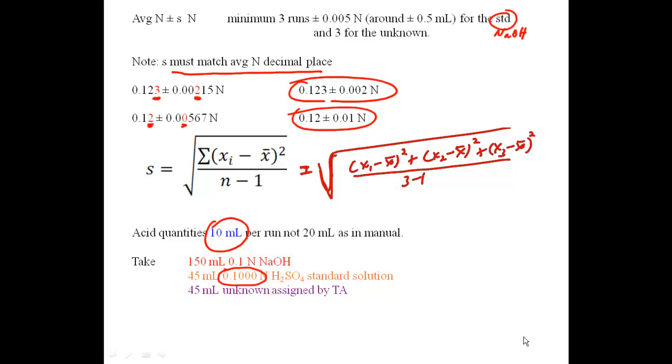As you're doing this experiment, make sure that you're writing the procedure in your notebook as you do it. You don't write the procedure later. You don't write the procedure when you go back to the classroom across the hall. The procedure is written as you do it in the laboratory, in your notebook. Everything is written in the notebook, not loosely, and not in the lab manual either. All data is recorded in the notebook as you do the experiment.